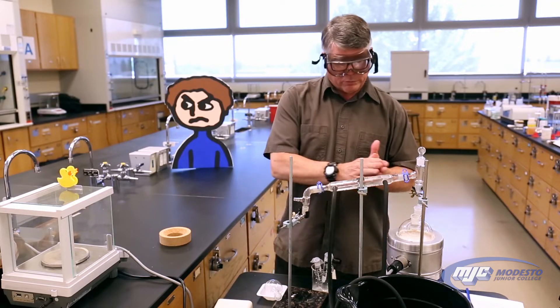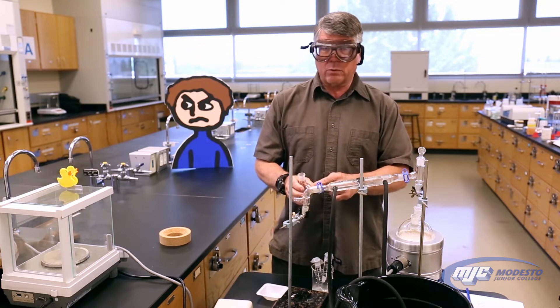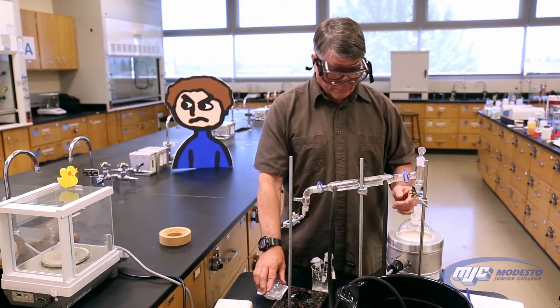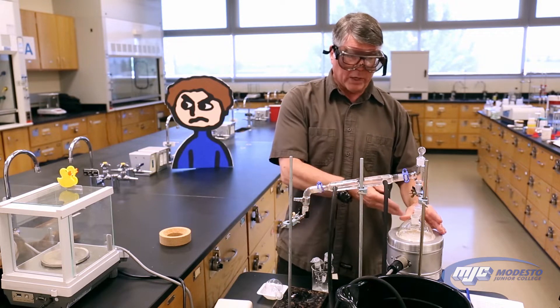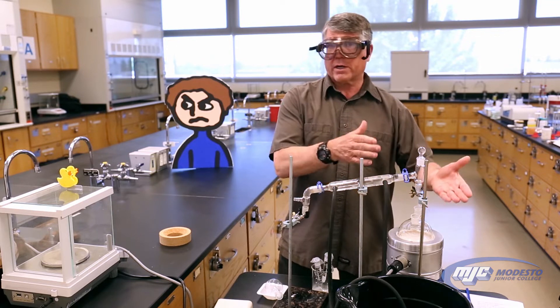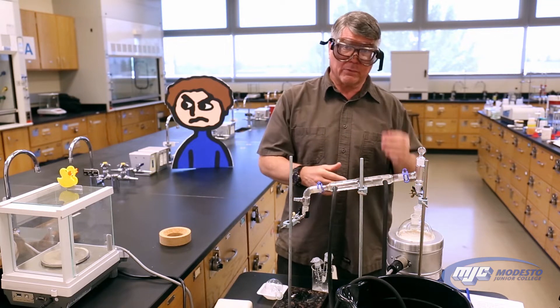So what will happen is we'll separate out the water. At this point, this is going to be distilled water, which is actually very pure. And we'll have the sodium chloride left over. The idea being that if we weigh the solution before and then weigh the sodium chloride afterwards, we can take the mass of the sodium chloride, divide it by the mass of the solution, times 100 — that's the mass percent of sodium chloride.